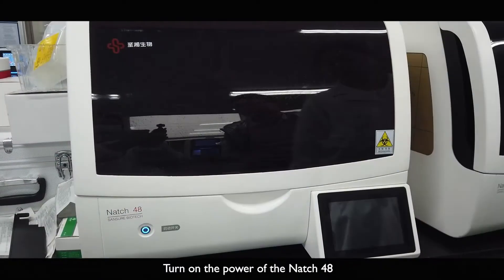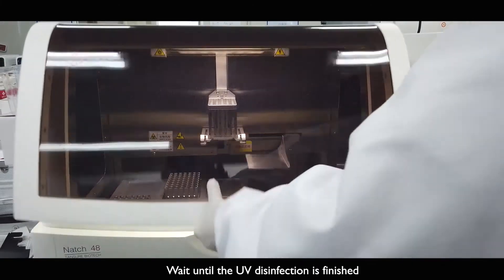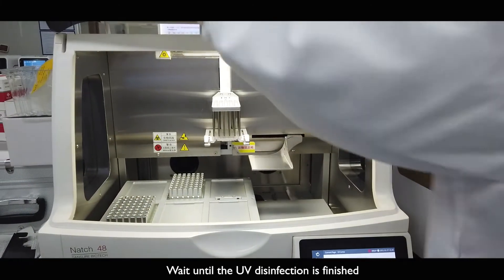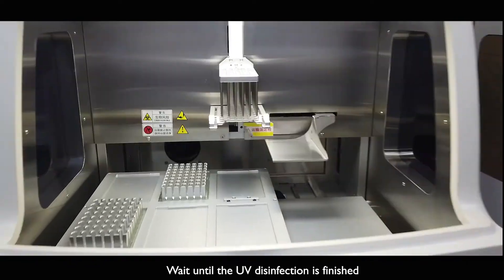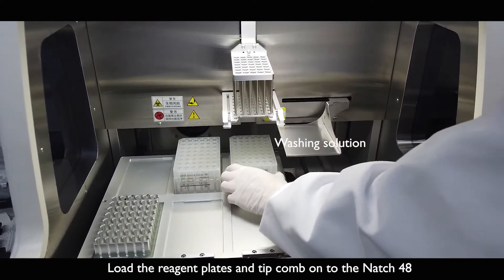Turn on the power of Natch 48. Turn on the UV lamp. Wait until the UV disinfection is finished. Load the reagent plate and tip comb onto the Natch 48.